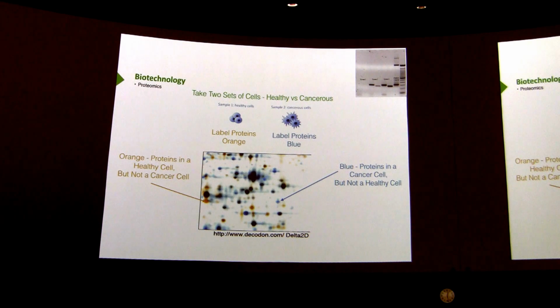I'm not sure I understand the question, but the question, as I understand it, is does the SDS affect the analysis here because I'm denaturing the protein? Is that safe to say? Okay. The answer is no, because again, I'm not trying to get functional protein out of this. Once I've treated this thing to, for example, the dye, many proteins would be just completely inactivated by that in the first place. So I'm not trying to get functional protein out. All I'm trying to do is to get the proteins separated here. Okay? Question?